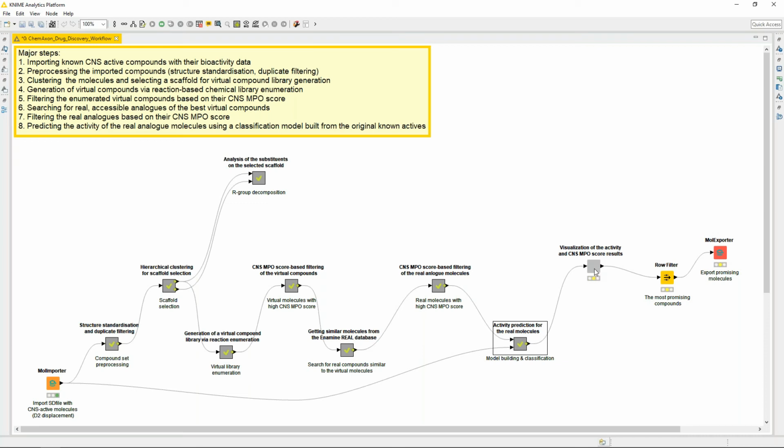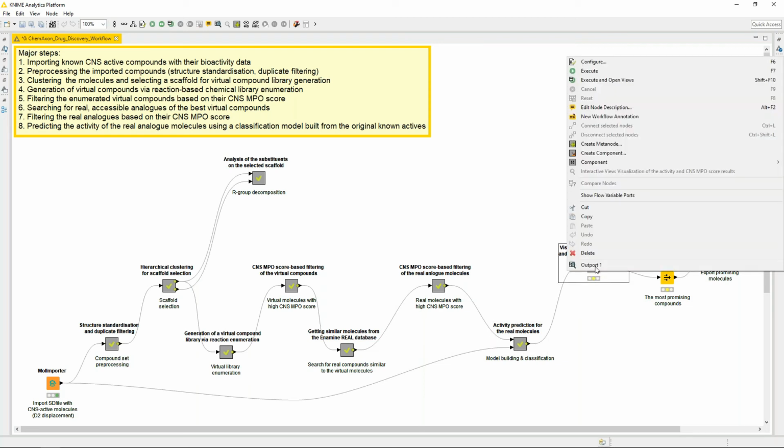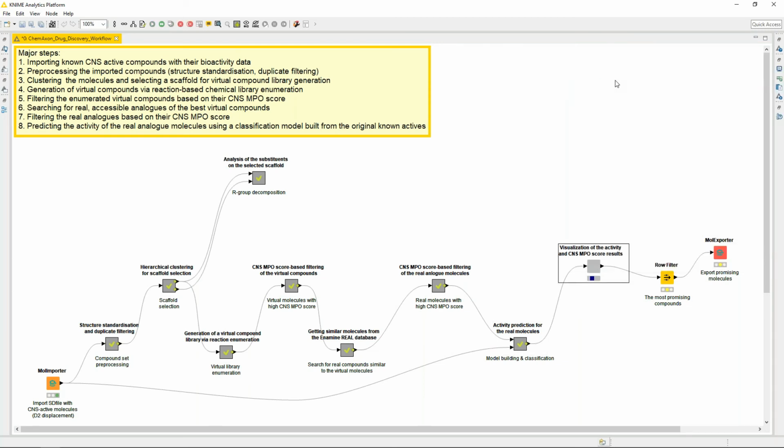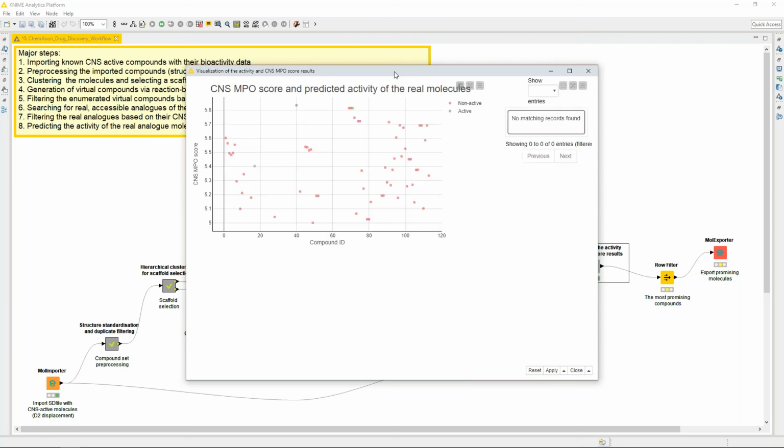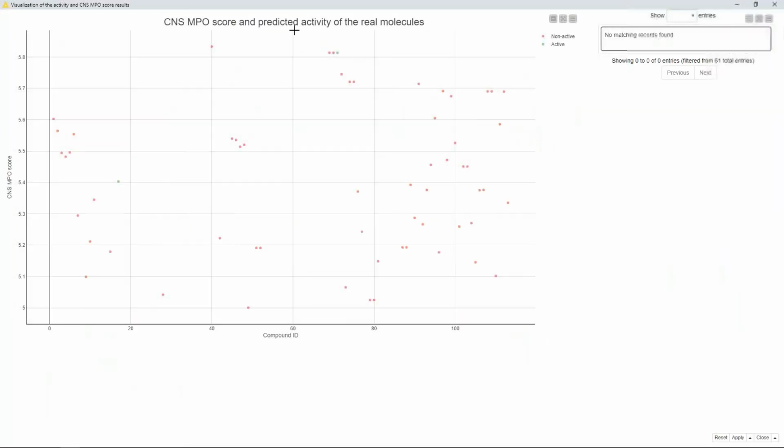manually or with some table manipulation, row filtering, or we can also do some visual analysis and selection using one of the interactive KNIME nodes. In this case, a visual component was built, which contains a scatter plot of the molecules, which you can see here, and contains another panel where we can see molecules that we have selected.